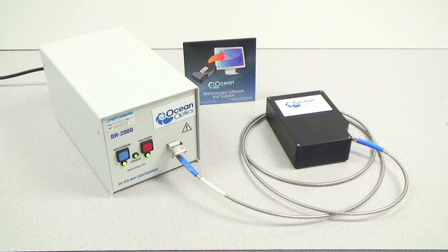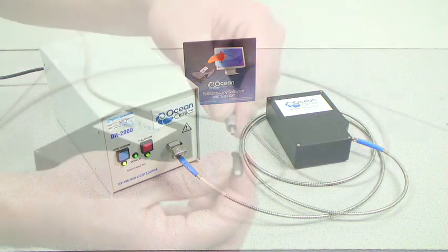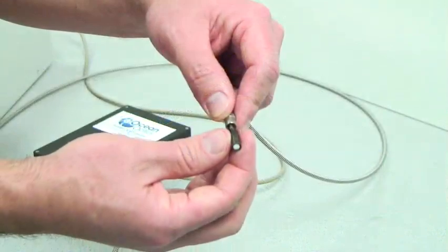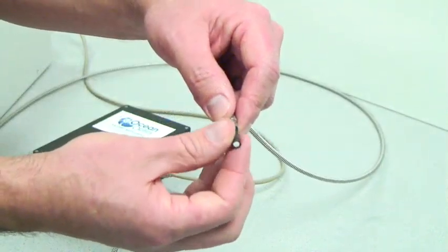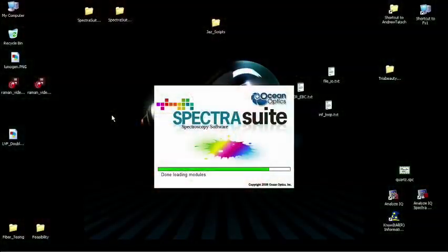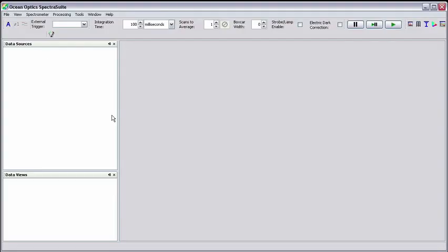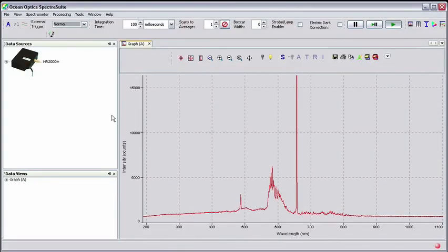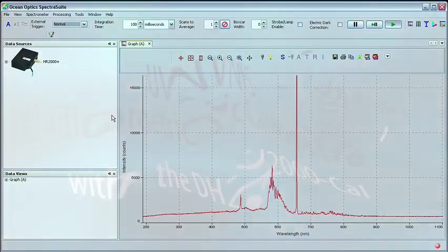In this tutorial, we'll show you how to radiometrically calibrate an Ocean Optics Spectrometer Inspector Suite for applications that use a cosine corrector.